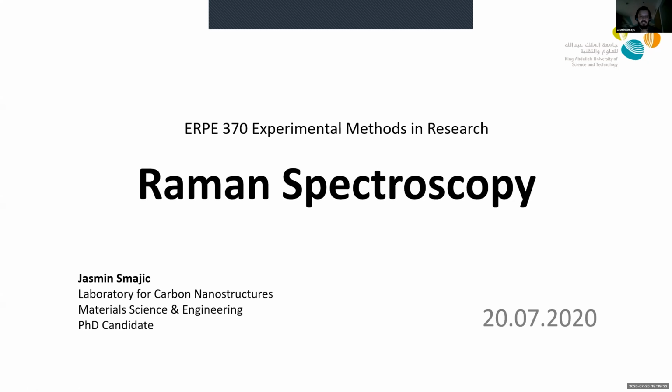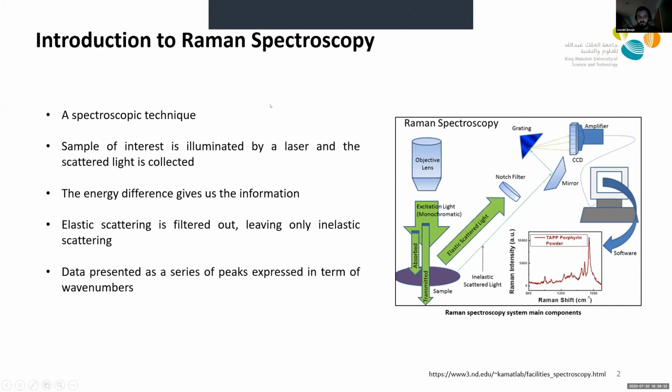I'm Jasmin, and I'm coming from the Laboratory for Carbon Nanostructures. And today we're going to talk about Raman spectroscopy. The key in understanding Raman spectroscopy is in its name, because since it is a spectroscopic technique, it means that we are going to be using the light-matter interaction. So thanks to the light, we're going to be analyzing the material itself.